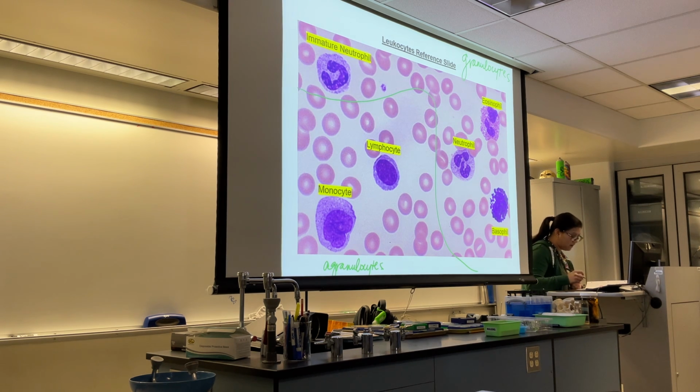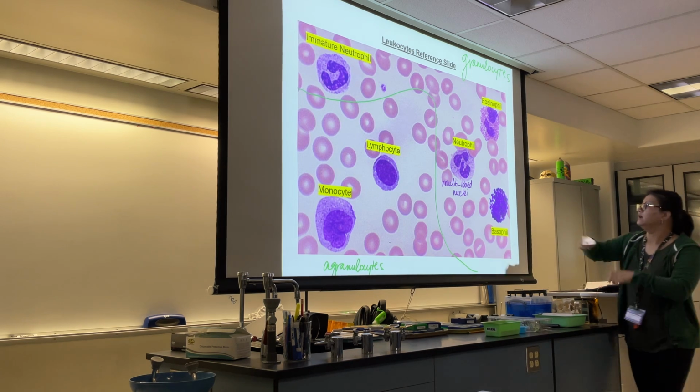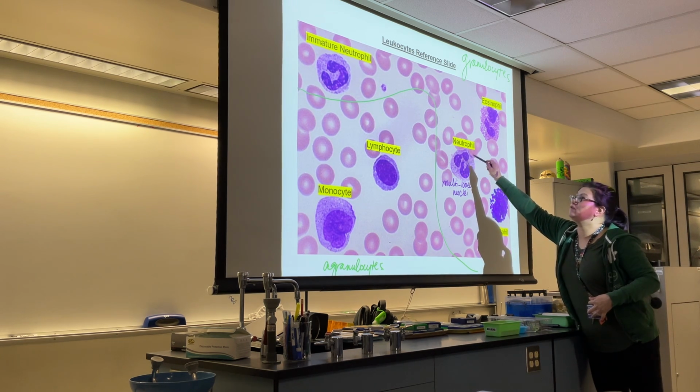Okay. So, what I'm going to do right now is I'll go through the characteristics of each one. I will start off with the neutrophils first, and let me change the color here. Purple? Okay, so for the neutrophils, your telltale characteristic for these guys is that they are going to have multi-lobe nuclei. So if you notice in here, notice how you have a nucleus that has a number of lobes.